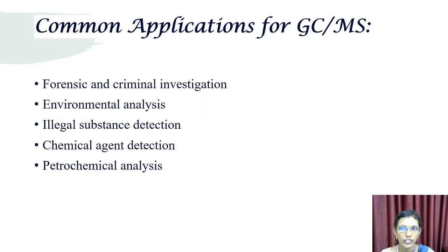We already saw that GCMS is applicable in most fields. The common ones are forensic and criminal investigations, environmental analysis, illegal substance detection, chemical agent detection and petrochemical analysis. Not only these, GCMS is widely used and applicable in our day-to-day life too.